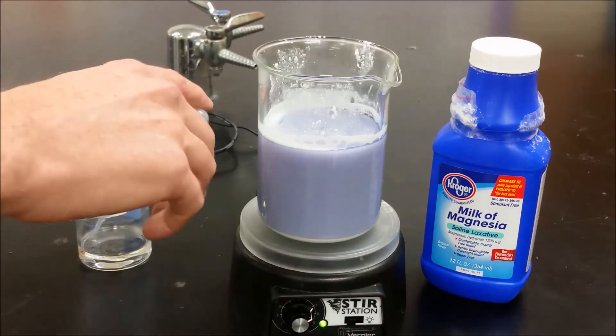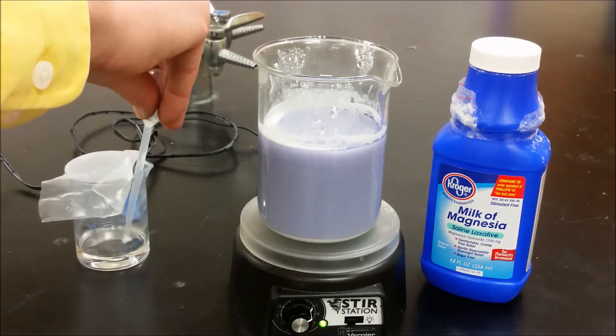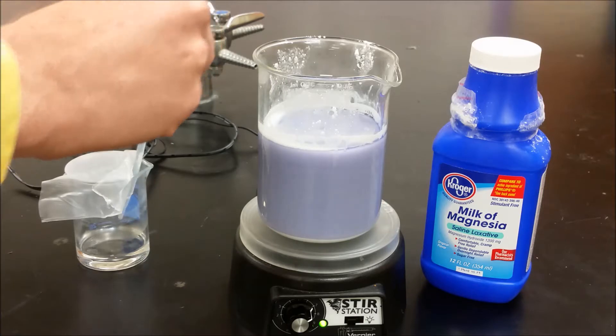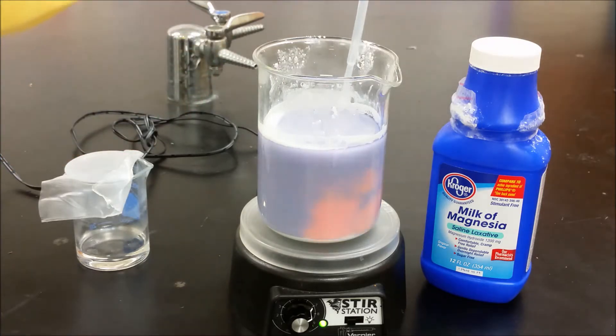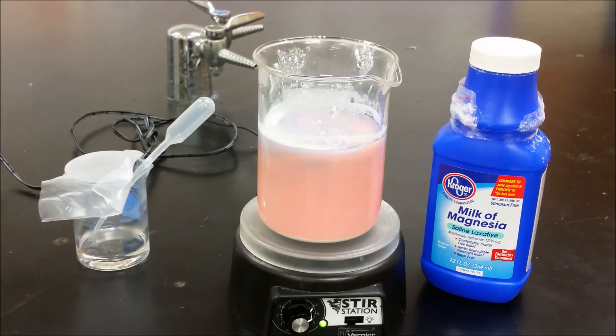Over here we have hydrochloric acid, which is very soluble in water. When we add a splash to the mixture, the Universal Indicator quickly changes to an acidic color.